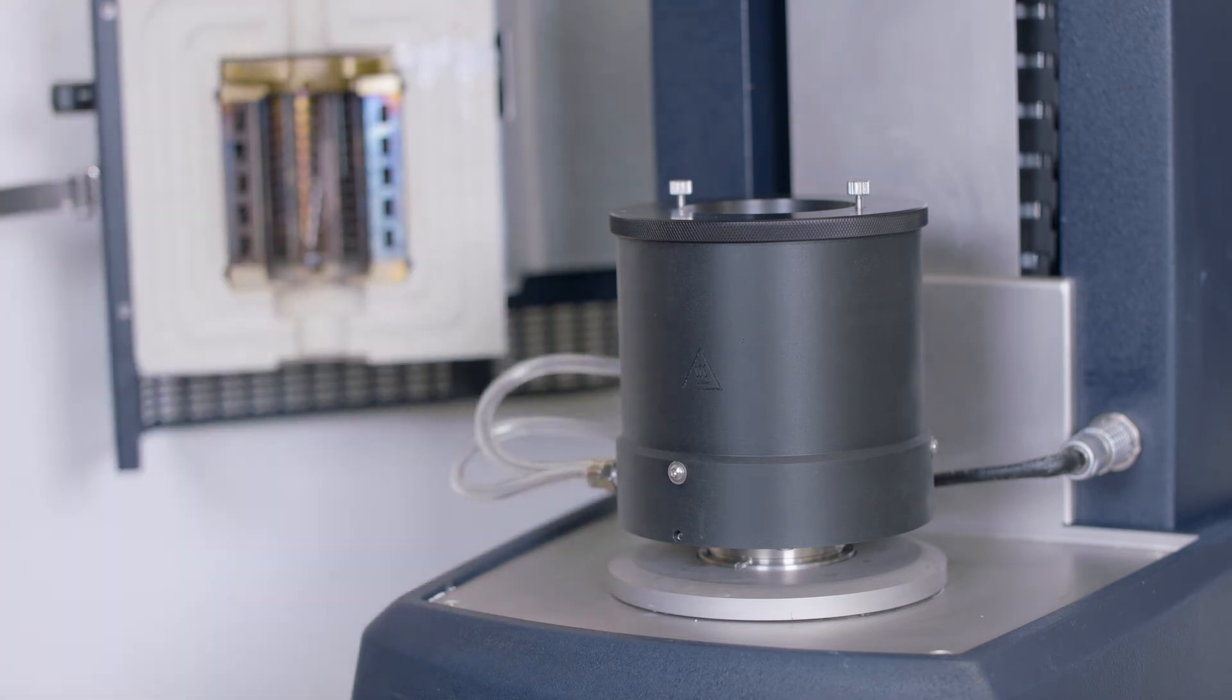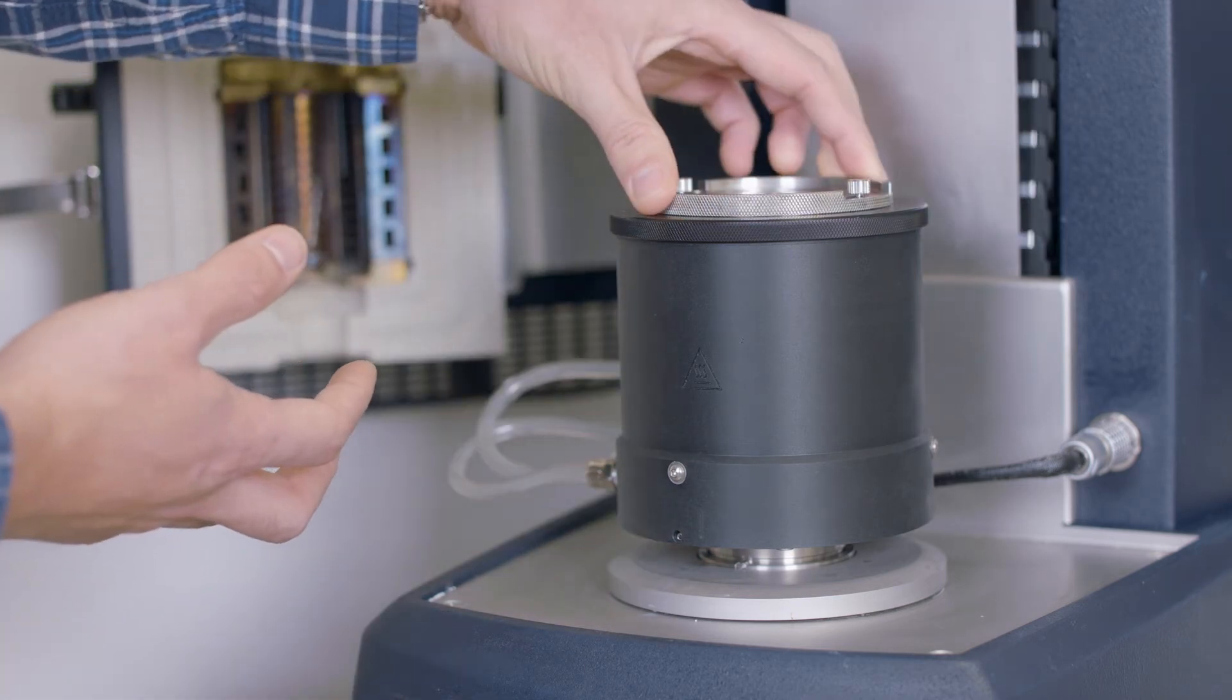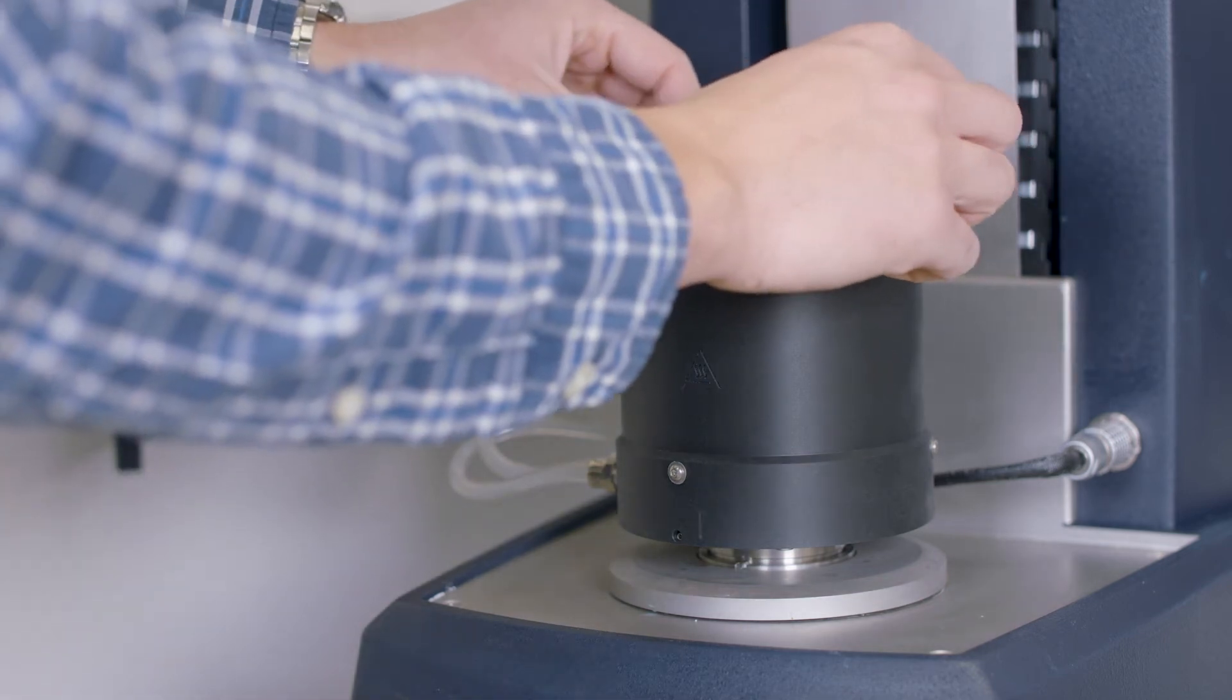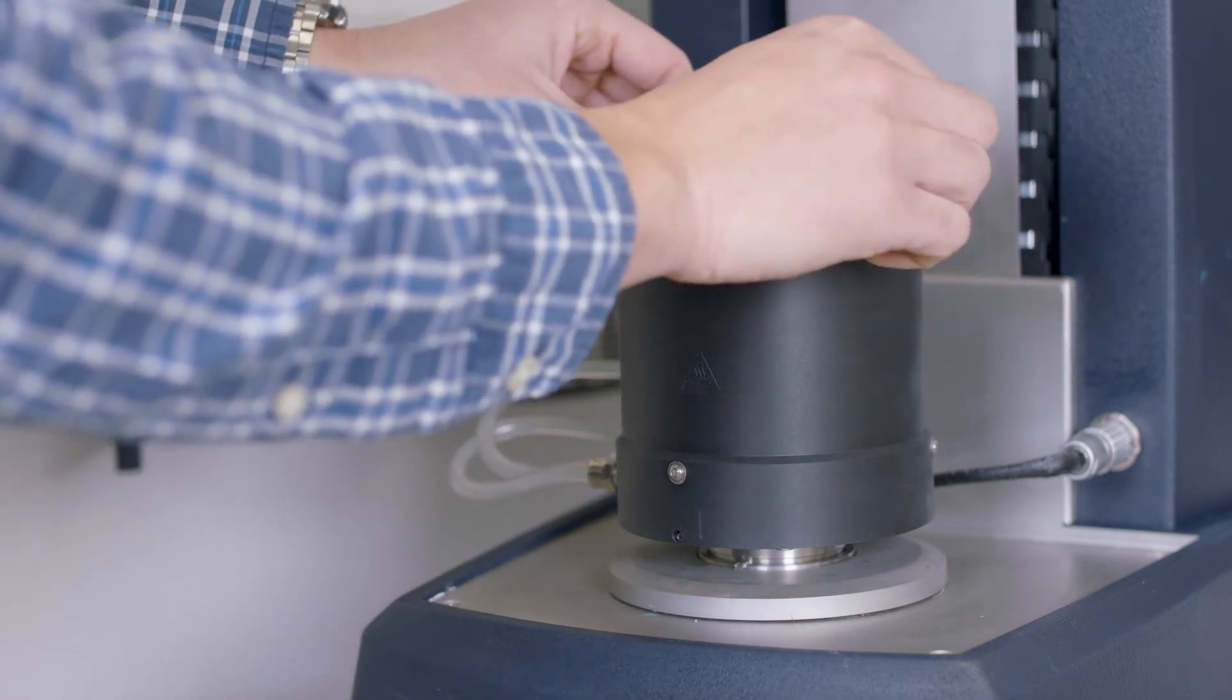Next we will install the concentric cup into the Peltier jacket by placing it inside and tightening the thumb screws.